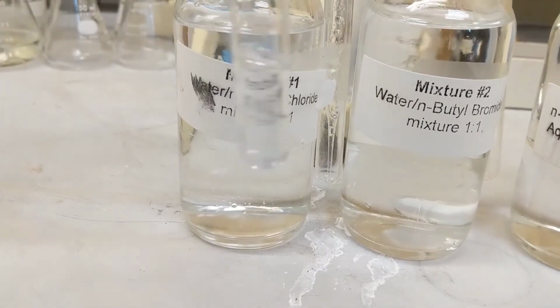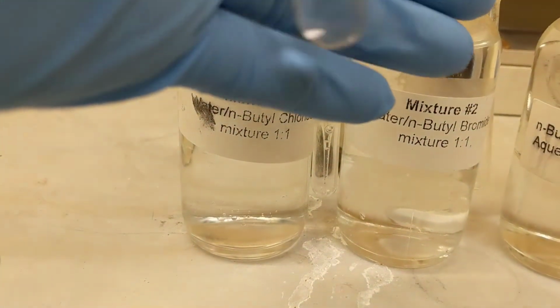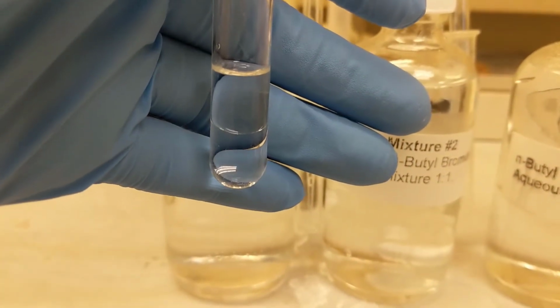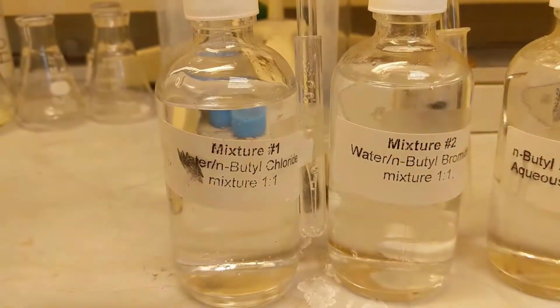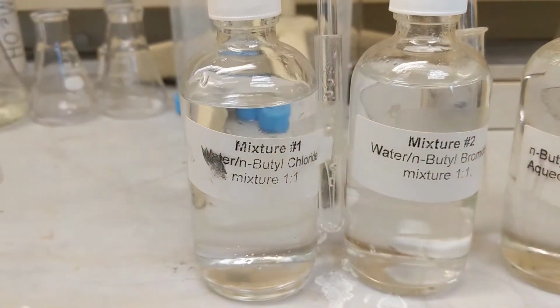You can see there are two distinct layers. You have to decipher which layer is which. Remember, this is mixture 1. What's the top and what's the bottom?